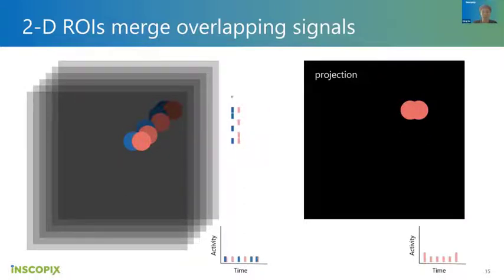If you want to use their temporal profile, for example, these blue traces represent the activity as a time series, and they have overlapping firing, but they also have some differences at different time points. If you go into the movie to try and pick up when they could be different, that would be really time consuming. So the automatic method from PCA-ICA will solve these issues.